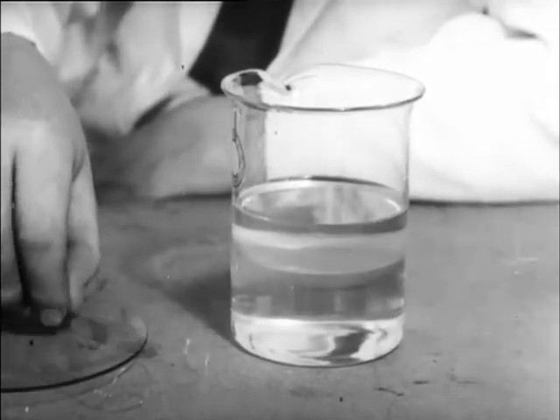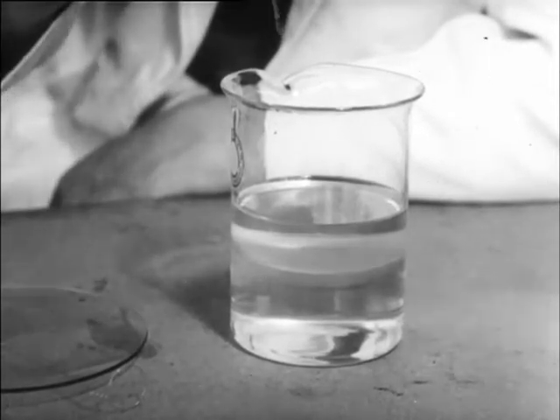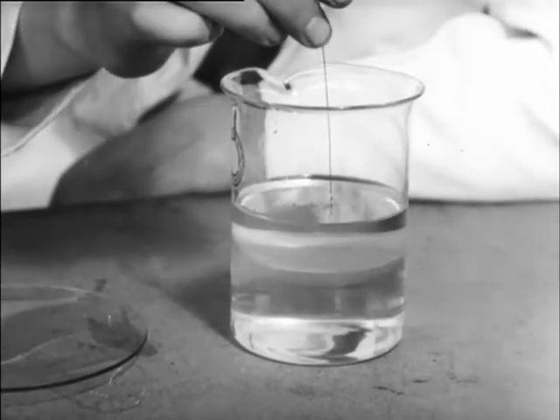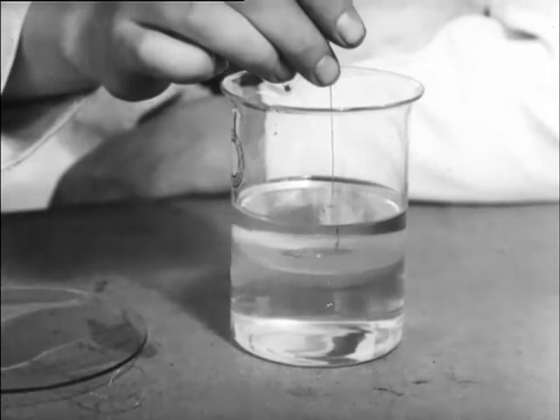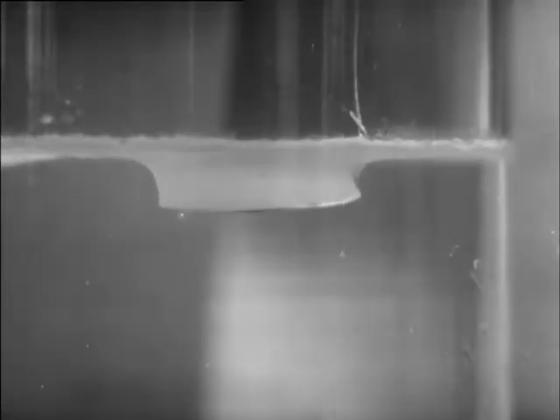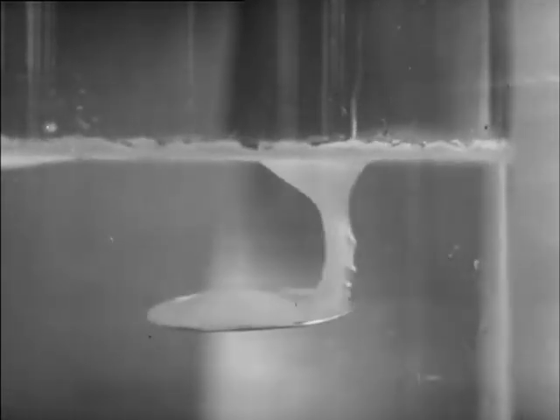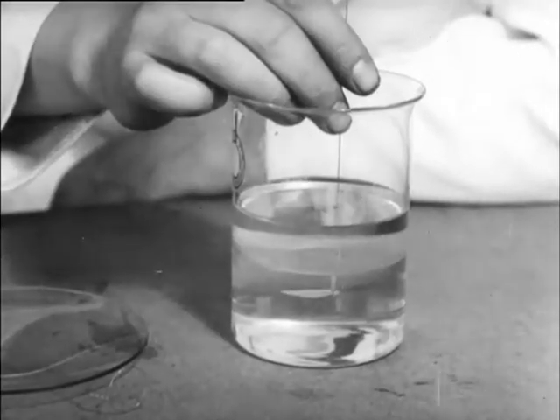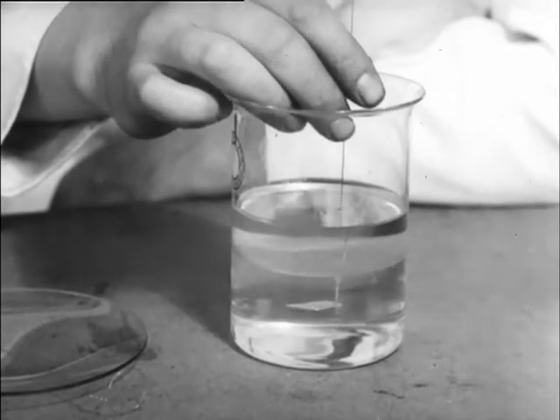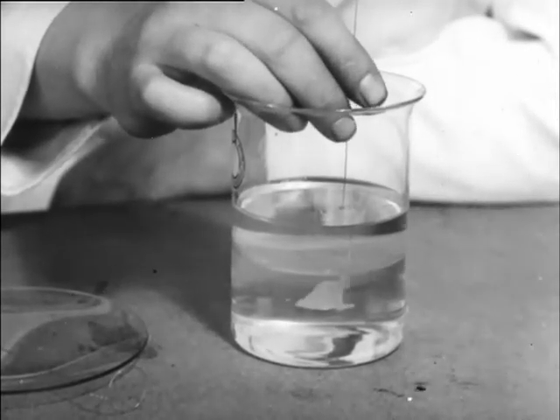This invisible membrane exists not only between liquids and air but at an interface between one liquid and another. Here we have cod liver oil floating on water. By pushing down a ring of platinum wire, we can make visible the membrane by detaching it on the ring. The tension in this case is called interfacial tension.